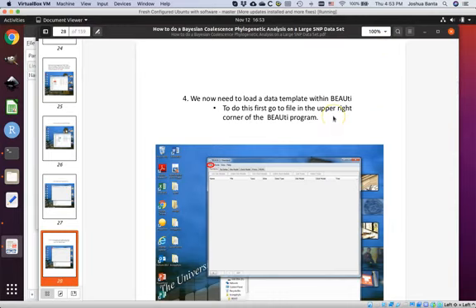Do understand that the tutorial is going to tell you to close BEAUTI and reopen it again. You'll need to reopen BEAUTI the same way I showed you: have a file explorer open, have the terminal window open, type 'cd space,' drag over that path, hit enter, and then type './BEAUTI'. You'll need to do that each time the tutorial tells you to close and reopen BEAUTI.